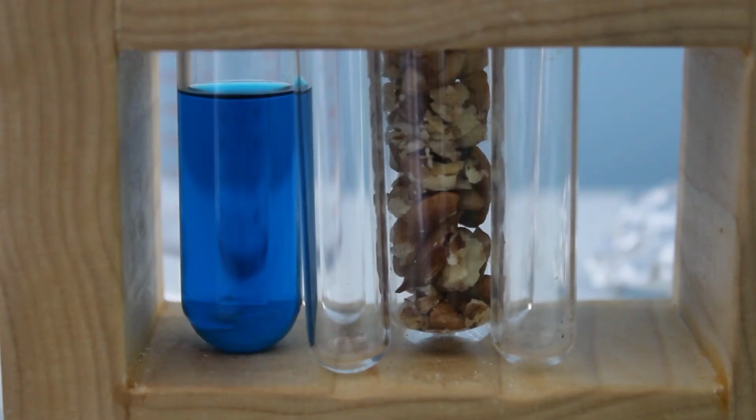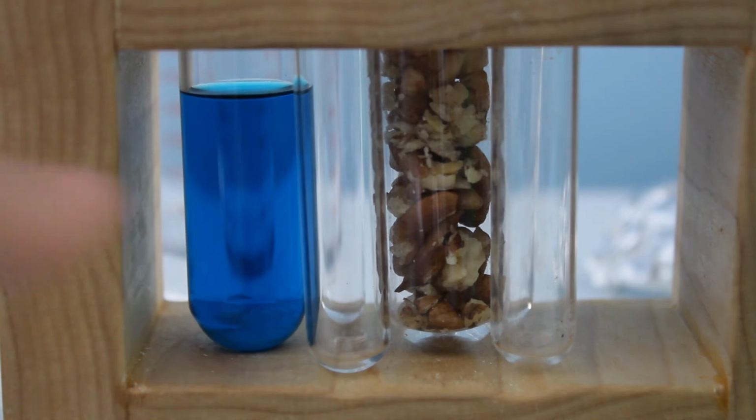Here we've got some nuts, hickory nuts specifically. I have a hickory tree outside and it keeps dropping these nuts everywhere, so why not use them, right? They're edible, but I want to find out how much sugar they actually have, so I'm going to put them in water and then boil them to bring their contents into the water itself in order to examine it using our Benedict solution.